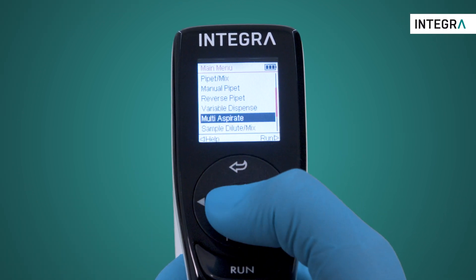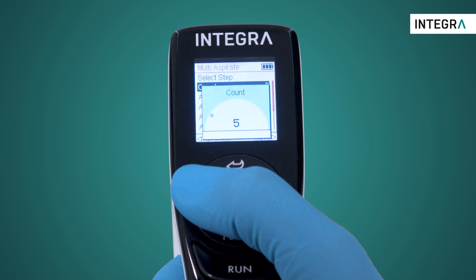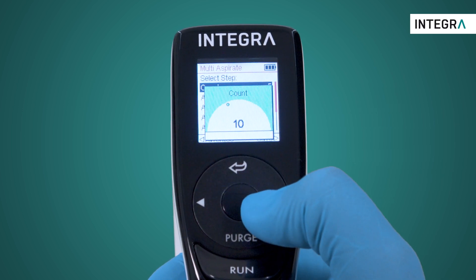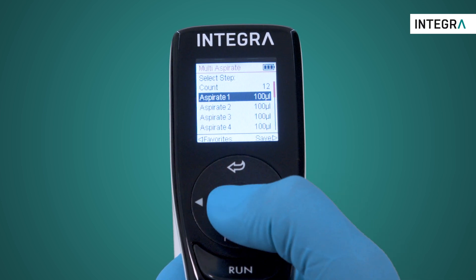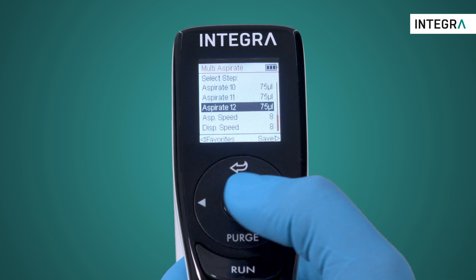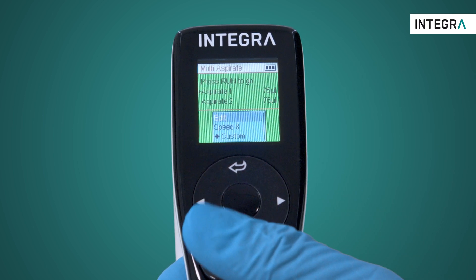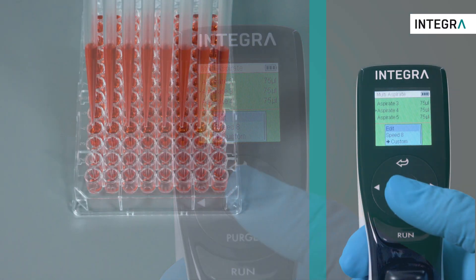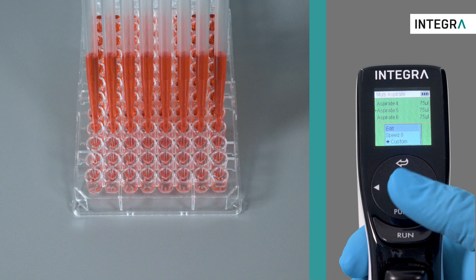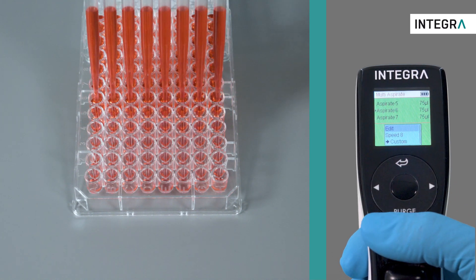After entering the mode from the main menu, simply edit the settings for the count or number of aspirations, and then how much you'd like to aspirate for each aspiration. If it's the same volume, simply set the volume the same each time. After that is set, simply start by pressing Run, and the first aspiration begins. Every time Run is pressed, the aspirations which were programmed will occur sequentially.